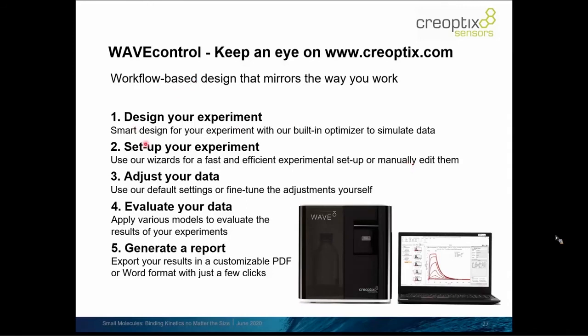It has a built-in simulator also, and really setting up your experiment and build your measurements up to optimization also of your experiment. You can use wizards to automatically come to a very quick starting point, but then the software lets you full manual control on all the parameters that are associated with the injections itself, and the whole series you can manually really edit to detail also by hand if you want.